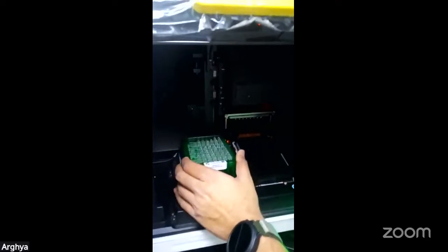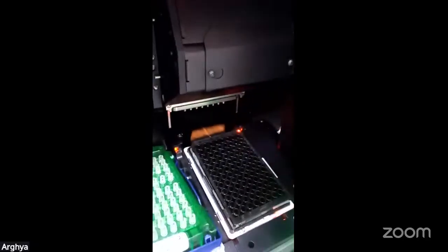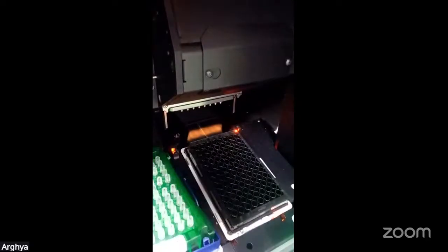This is the robotic arm. It moves this way and completely to the left or right. It takes the optical sensors from here and then goes to different samples in this analyte chamber. Also, when we are using it, we need to have plates over here so that the sensors don't go dry. You can see that the plates are black, which is again to prevent light reflection or light coming into the plate. The only light source will be from the machine, which actually makes the difference in detection.